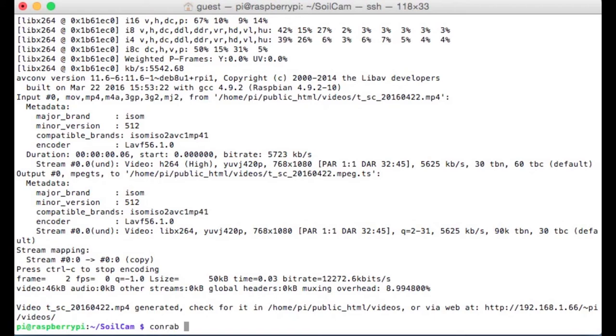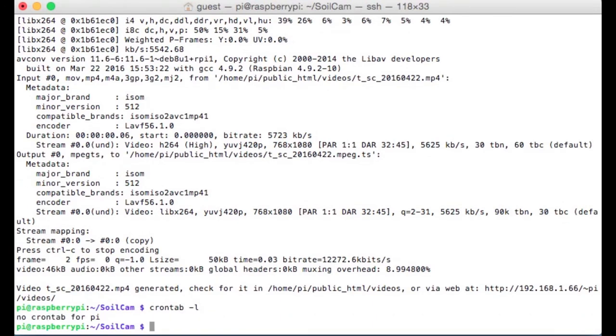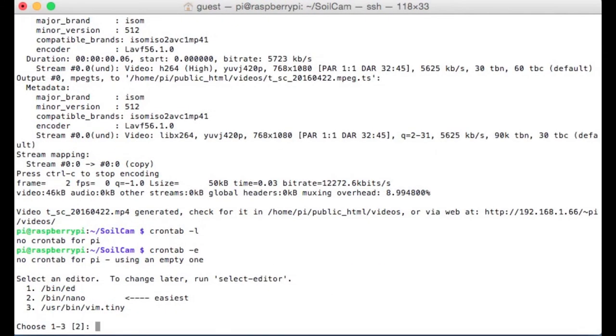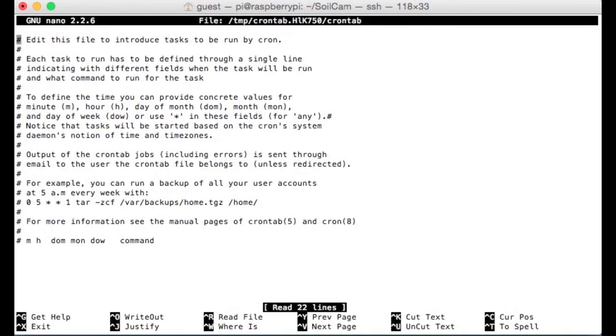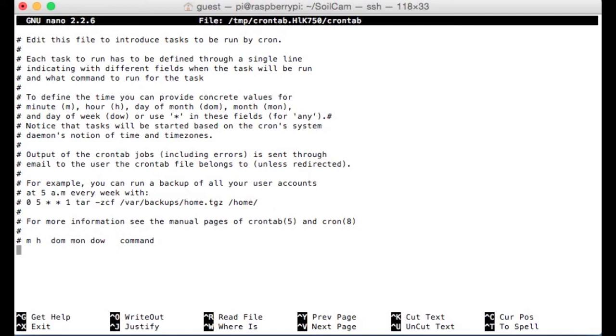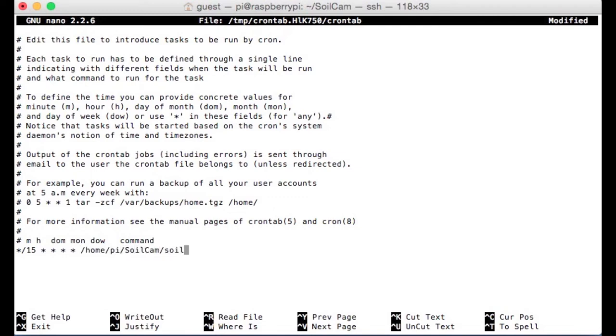If I type crontab dash l, that'll list the current cron scheduled processes. If I type crontab dash e, first it's going to ask me, which editor do you want to use to do some text editing. If you've never used vim or ed, go ahead and just use two. It's going to be nano. It's a very easy to use text editor. All these pound symbols are just comments. The computer ignores everything following that pound symbol. If I want to initiate a scan that's going to happen every 15 minutes, I can type asterisk slash 15, space, asterisk, asterisk, asterisk, asterisk, slash home, slash pi, slash soil cam, slash soil cam dot sh dash s.